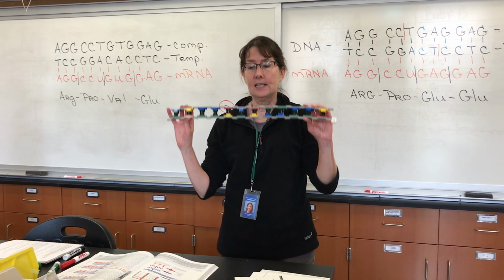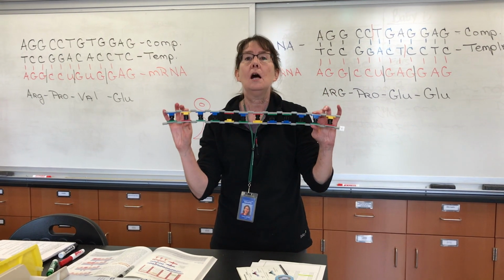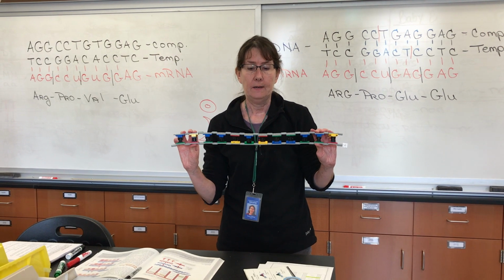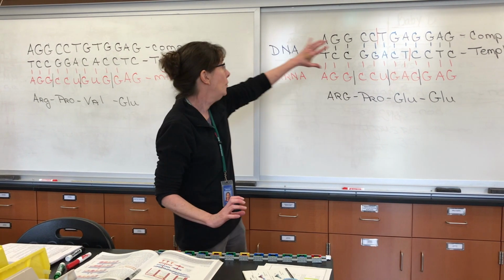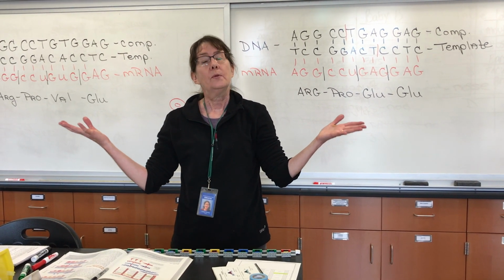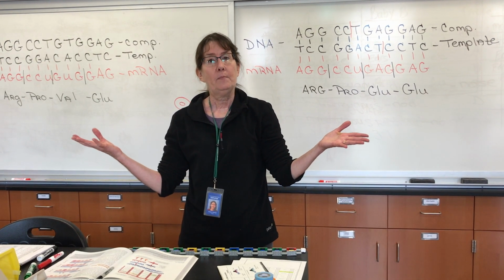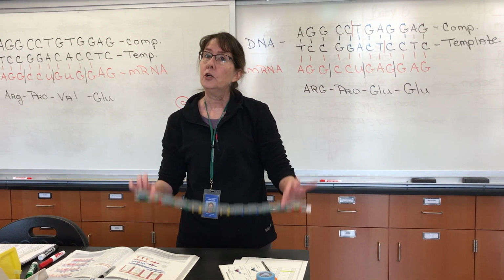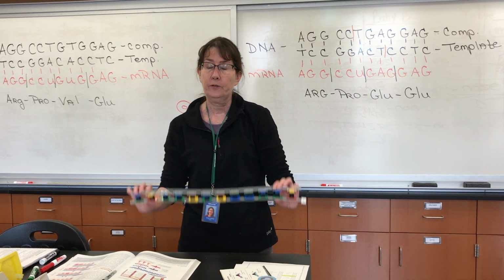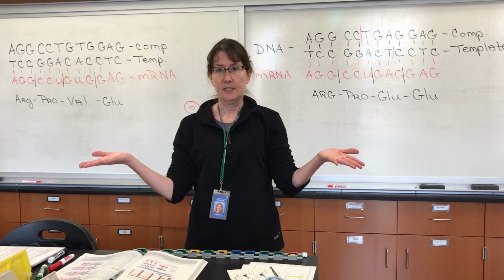A person with sickle cell disease, their DNA stays as one long piece of DNA when MST2 has been added to it. Remember, our normal DNA got cut into 2 smaller pieces. So in next week's lab, we can separate out DNA based on its size. The longer piece of DNA will not move through our gel electrophoresis as fast or as far as our 2 smaller pieces.